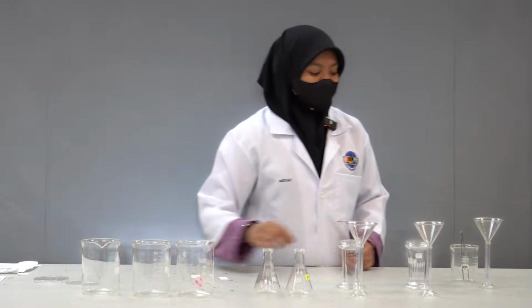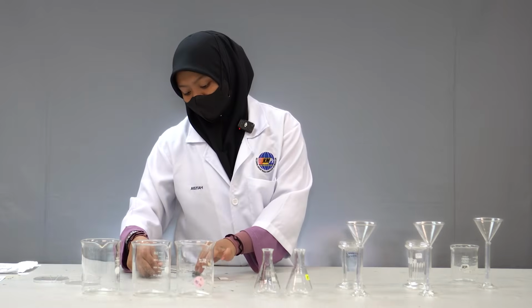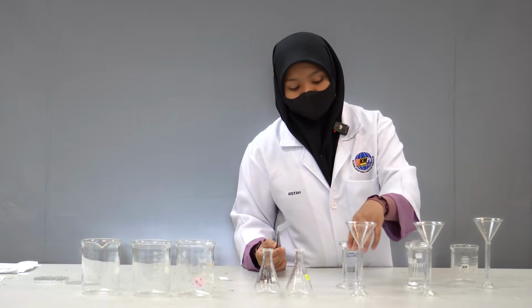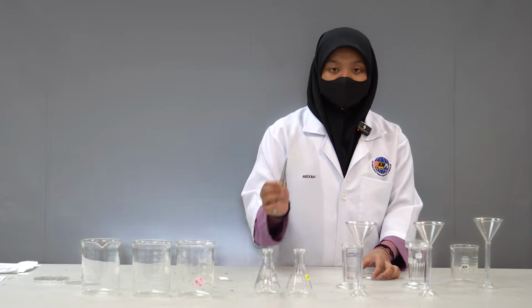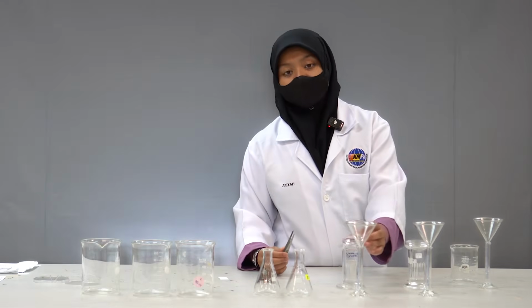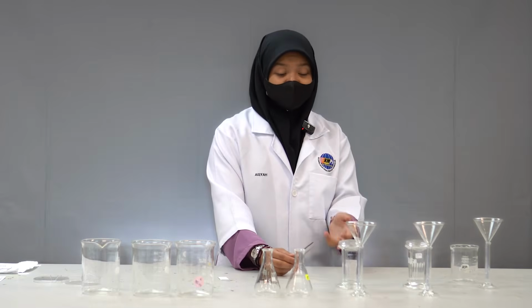After that, you take the forceps, and you take the first thin layer, which is also labeled HE, hexane and ethanol, and you look for the chamber labeled hexane and ethanol, and then you put your thin layer in. Until when do you want to develop it?